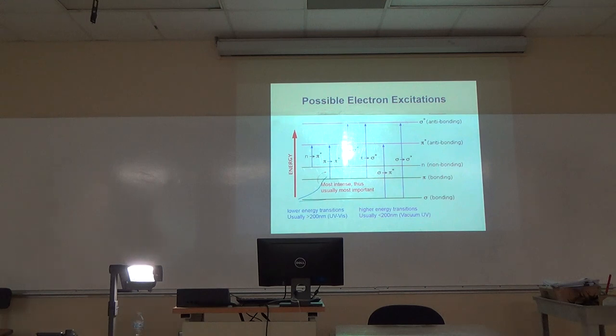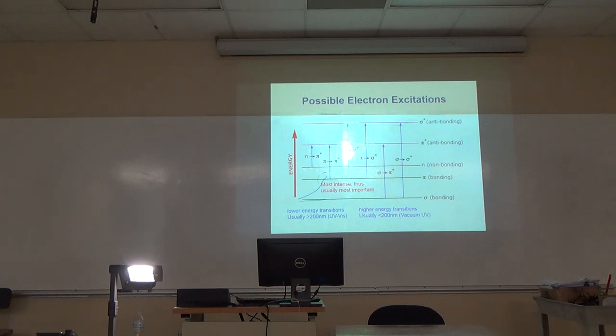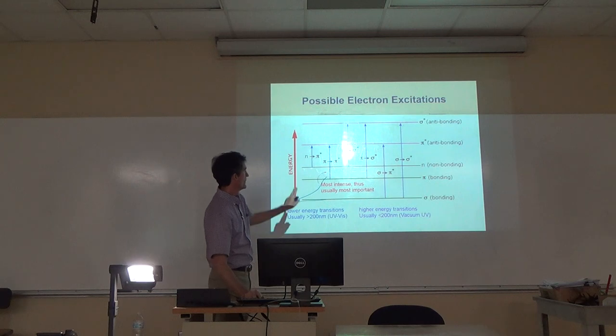When you run an IR, you put your little compound up there. Is there any oxygen up there also? Yeah, it's all around. But it doesn't hurt the IR. It does hurt the UV below 200. It obscures it. If you want to get data below 200, you have to do it under vacuum and remove the oxygen. That's why below 200 is often called vacuum UV. Most cheaper introductory UVs are not going to scan below 200 because they're not set up to deal with oxygen. That's what's going on.